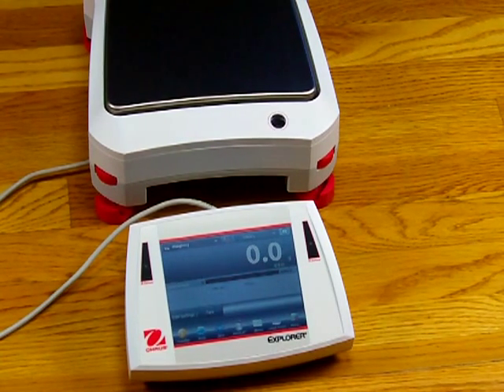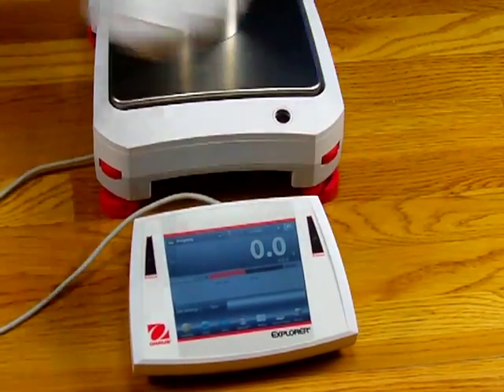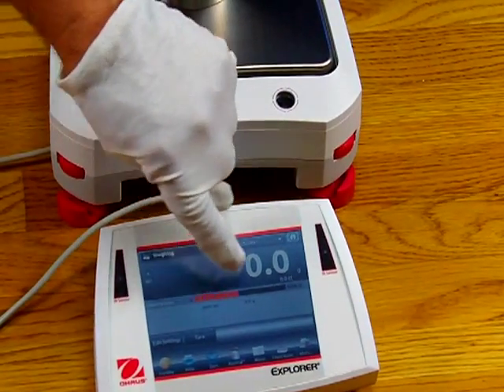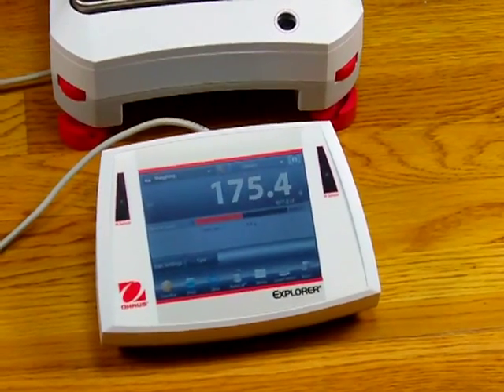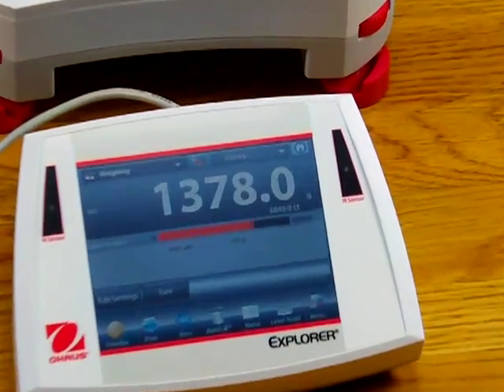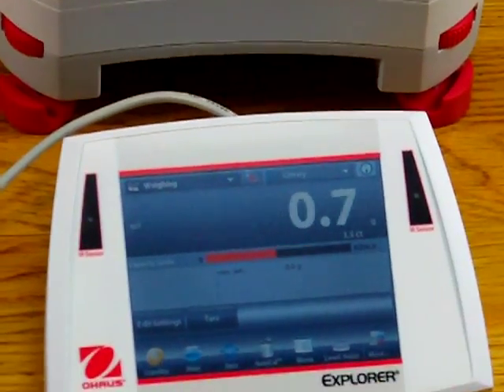The balance has 4 touchless sensors. These enable you to tare out the balance — you can configure them for whatever you'd like. With the 3kg weight on the balance, I can tare it out by just putting my hand over the sensor and it will zero it out. On the display there's a fill guide showing how much capacity has been used. This balance has 6,200 grams capacity, so if I add additional weight you would see the fill guide go up. With 6,200 grams loaded, you can see the fill guide in red, showing how much of the weight capacity has been used.